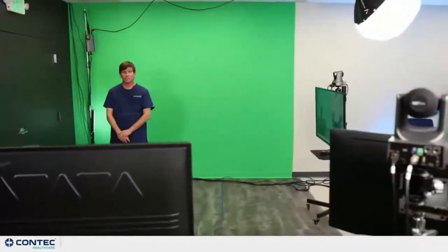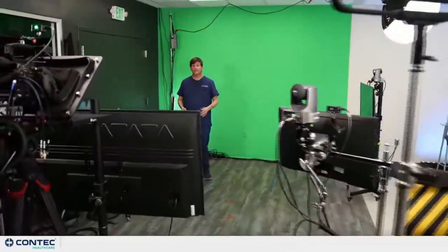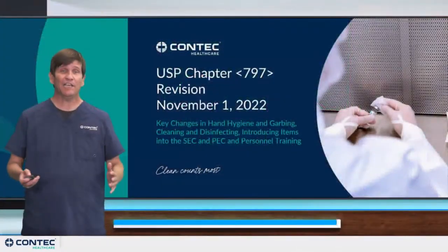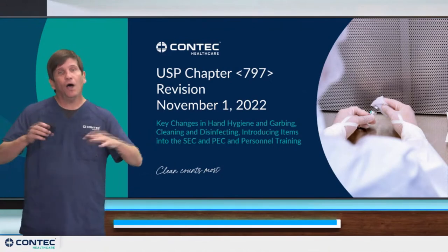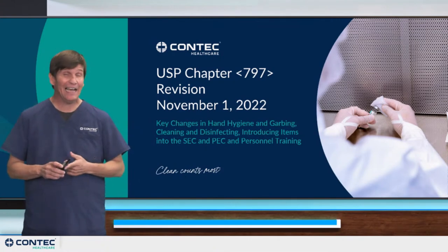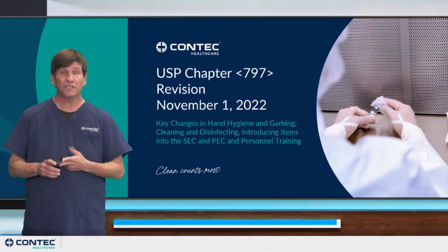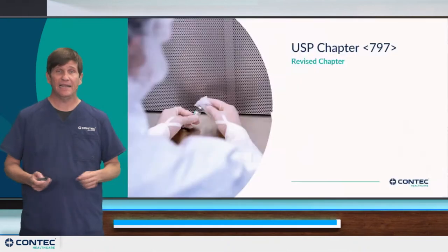Thank you so much, Jacqueline. I want to thank everyone out there today who has joined us as we walk through some of the key changes in this new chapter, specifically on these four broad umbrellas: key changes in hand hygiene and garbing, introducing items into the PEC and SEC, cleaning and disinfecting, and personnel training.